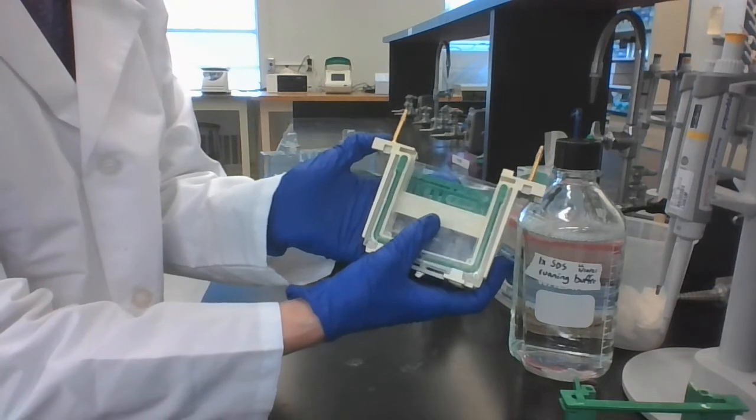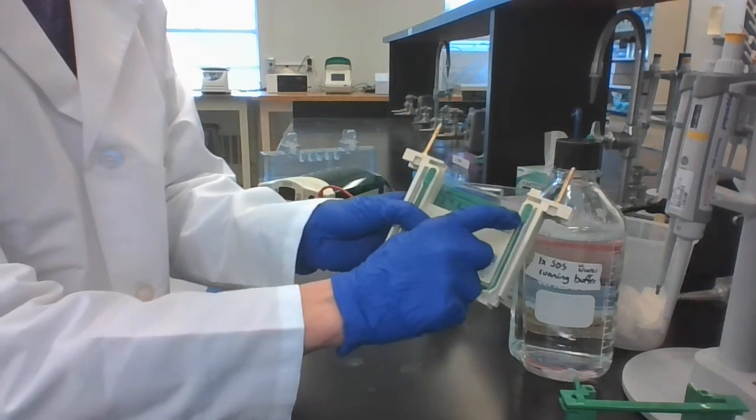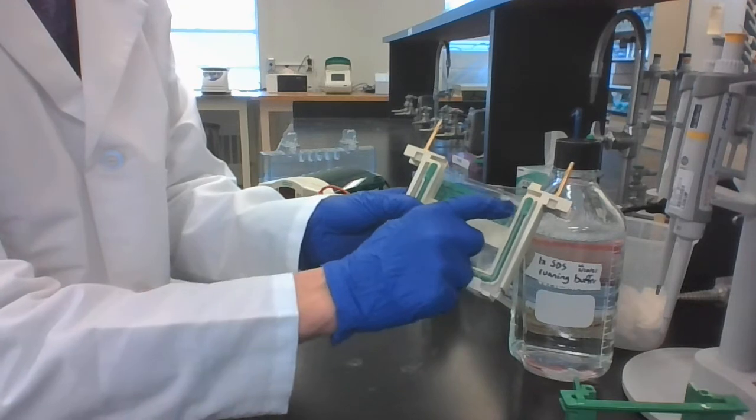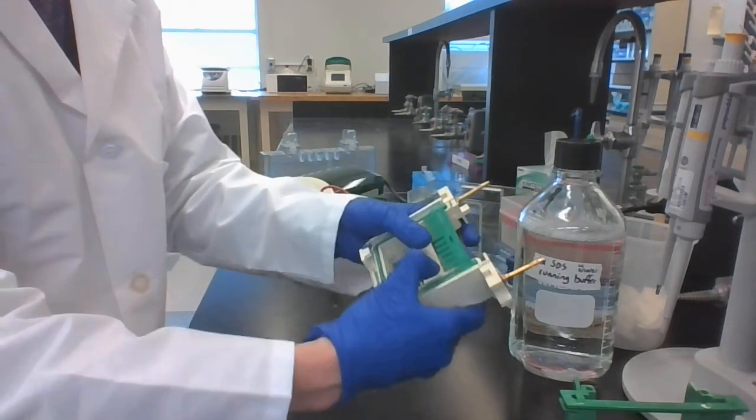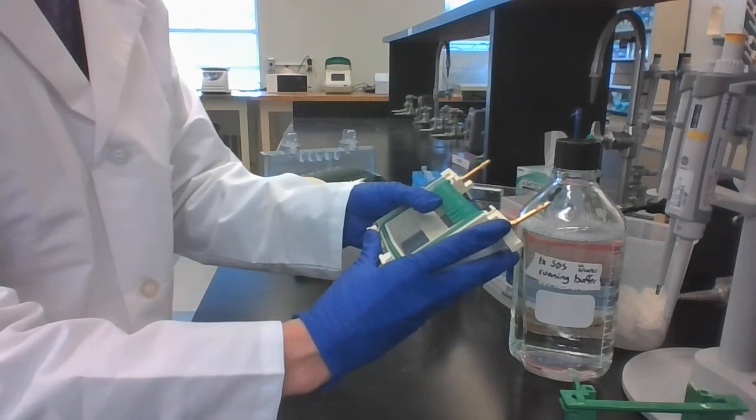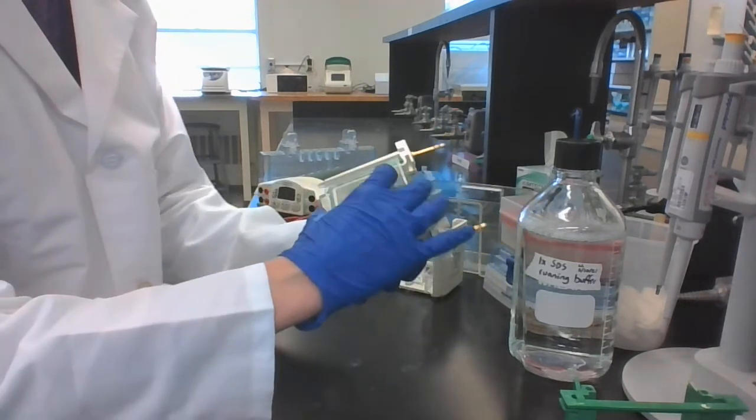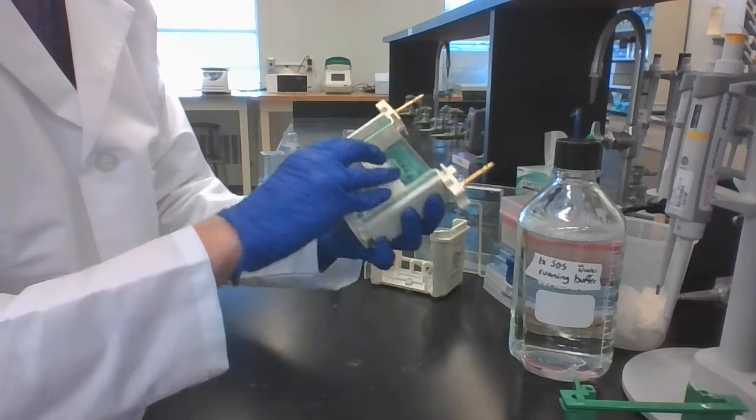Just gently slide it up, just so that the short plates or this part of the buffer dam is contacting the gasket and making a tight seal. Hold it there. Flip it around. Switch the other plate up a little. Do the same thing on the other side if you accidentally let go and it falls.